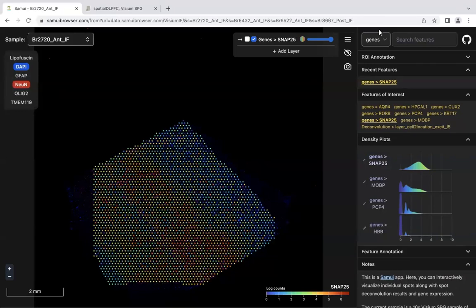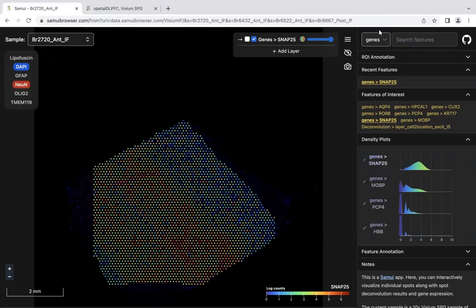Here are two of the resources that we have to publicly host the spot deconvolution results. The first is the Samui app. When you load the webpage, it shows the gene expression for SNAP25.